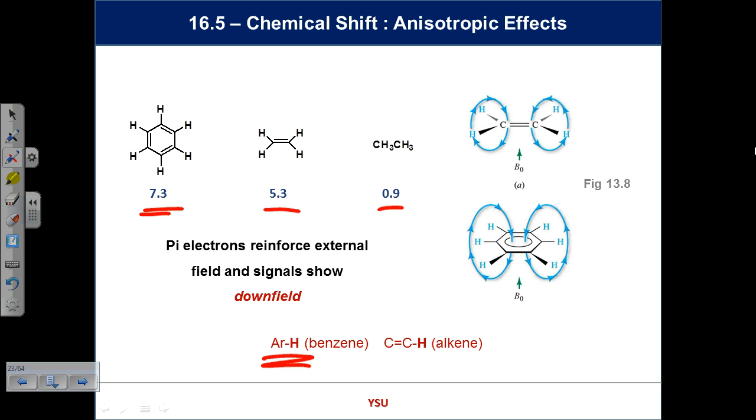By the end of this week, we ought to be able to work out, is it mono-substituted, di-substituted, is it 1,2 substituted, 1,3, 1,4, stuff like that, based on symmetry ideas. So an awful lot of stuff to come. This idea of the CH alkene, again, consistent. If you see something at 5, it's probably an alkene, or it could be something with an oxygen, or maybe an oxygen next to a nitrogen, something like that, where we add the pieces together.